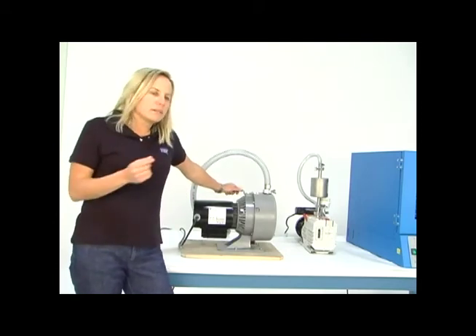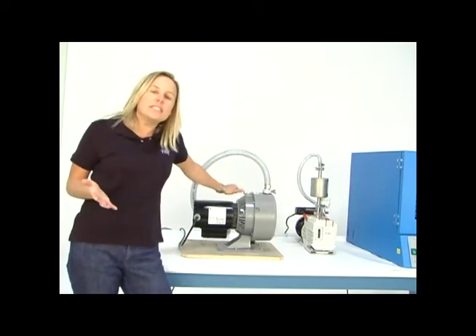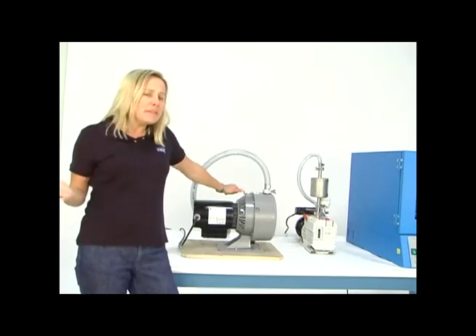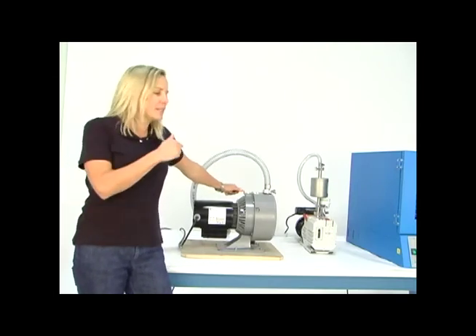On the maintenance front, there are tip seals inside a dry scroll pump and those need to be replaced at least once a year — some manufacturers say every 9,000 hours. If you see a decrease in pumping speed, it would be time to replace the tip seals.